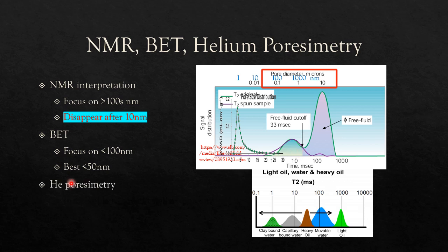And so helium porosimetry, on the other hand, measures anything that's accessible with free gas. If it has porosity sealed off by a salt or other process, as in a lot of the unconventional, where you need water to open up this nano porosity, then helium porosimetry can't measure it. That's why we see many porosity data measured with helium porosimetry are really low, ridiculously low, can't match the porosity.